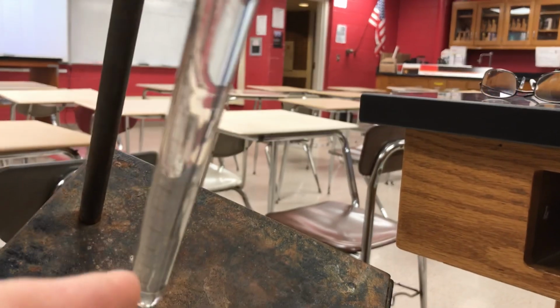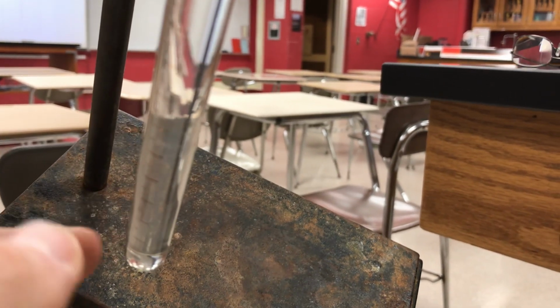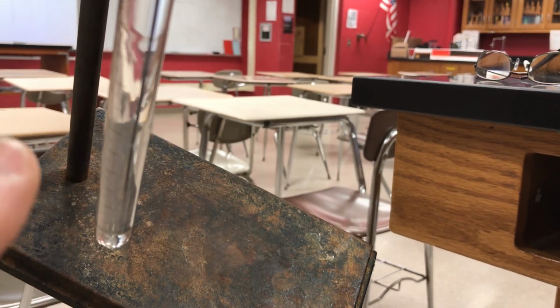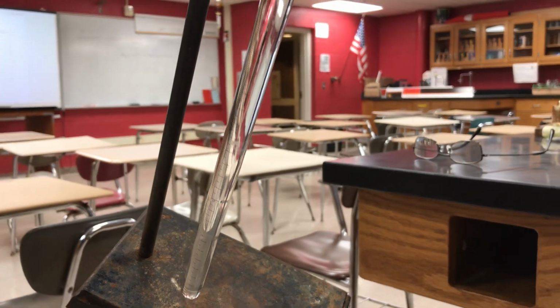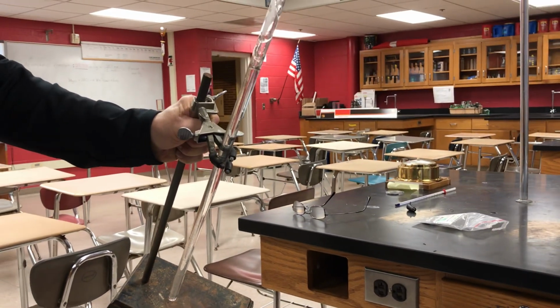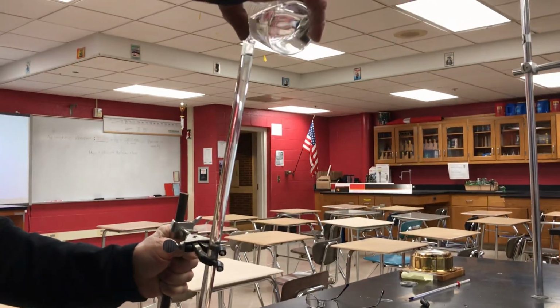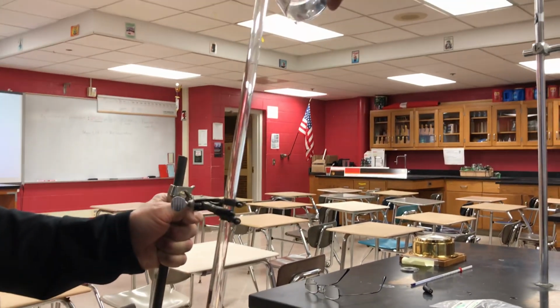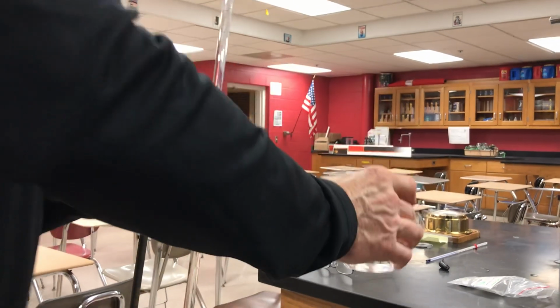But then down here, we've got very concentrated HCl that the water hasn't been able to make its way down to. Remember, the HCl is more dense than the water, so the water that Mr. Havel's pouring in just sits on top of it. It's going to go all the way to the top. We don't want any air in this system. I think I've done that.